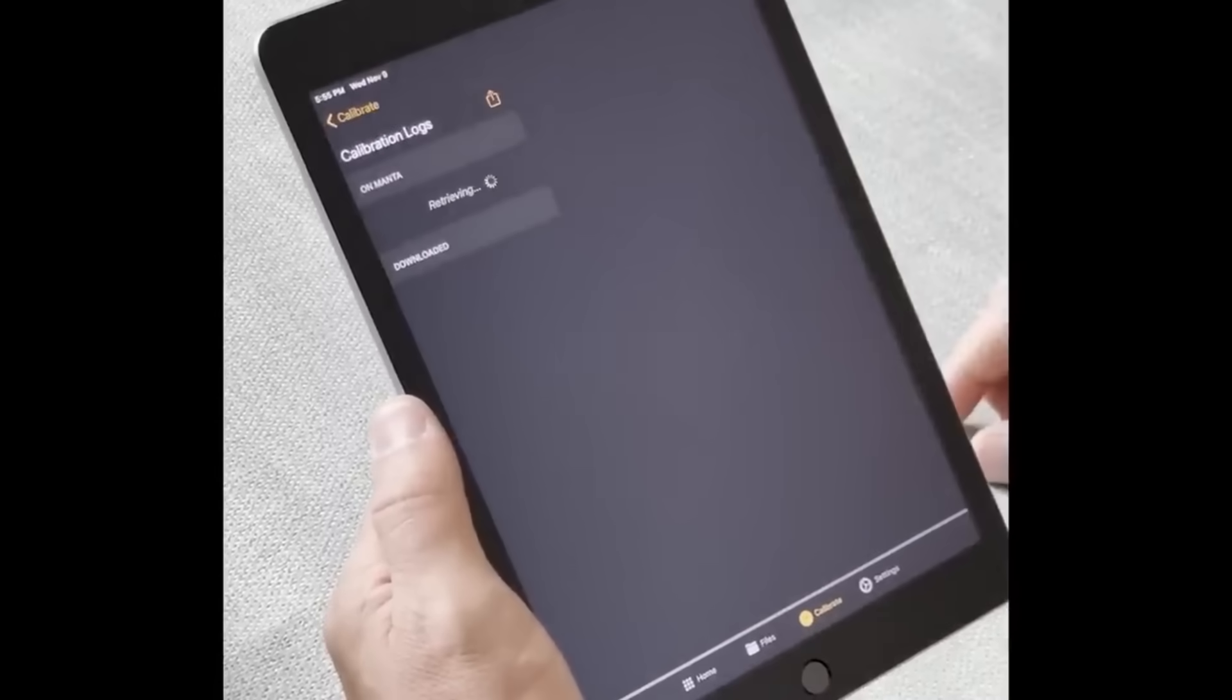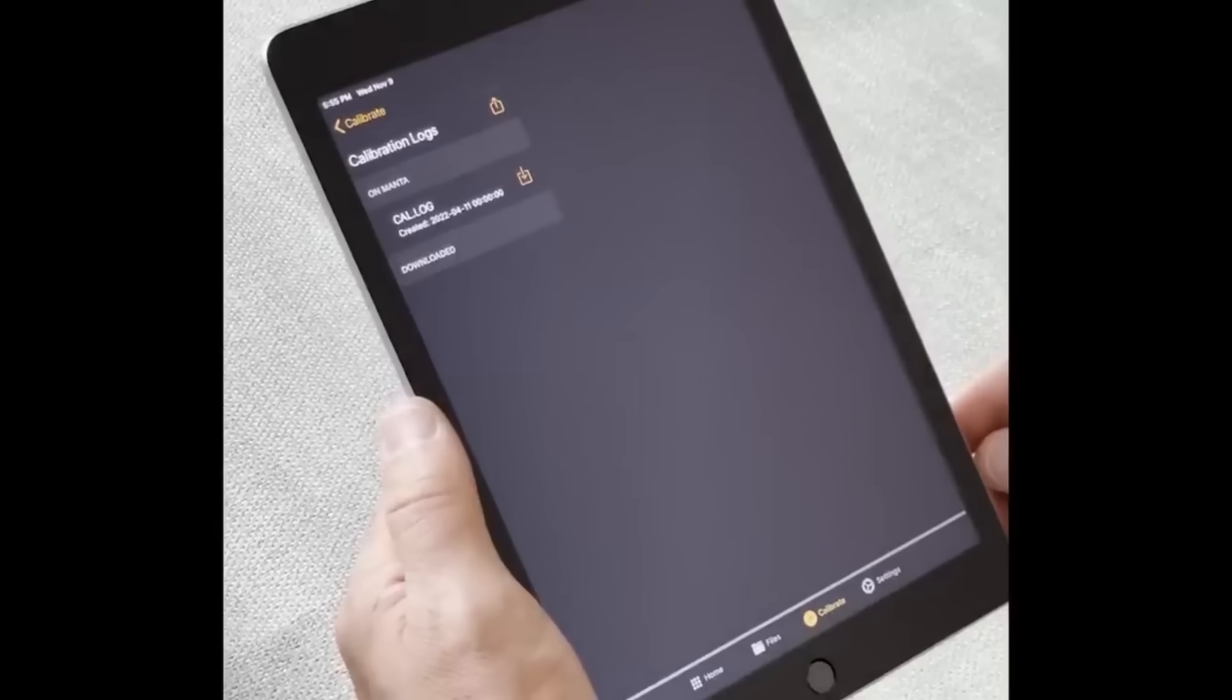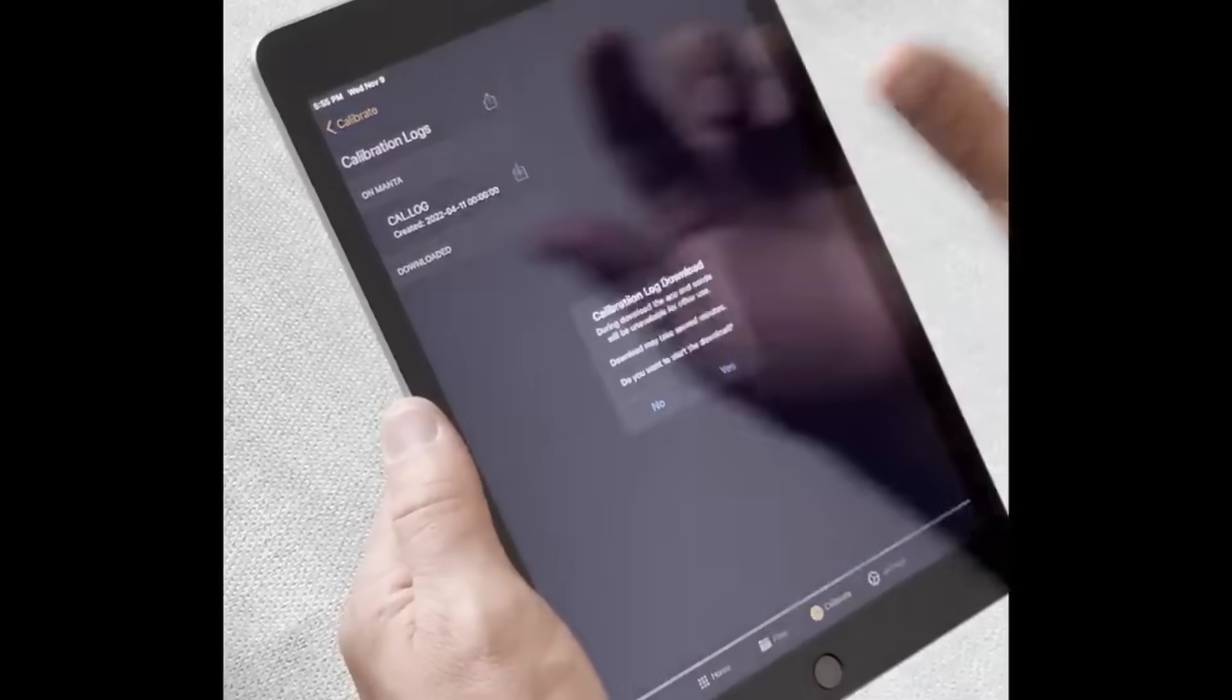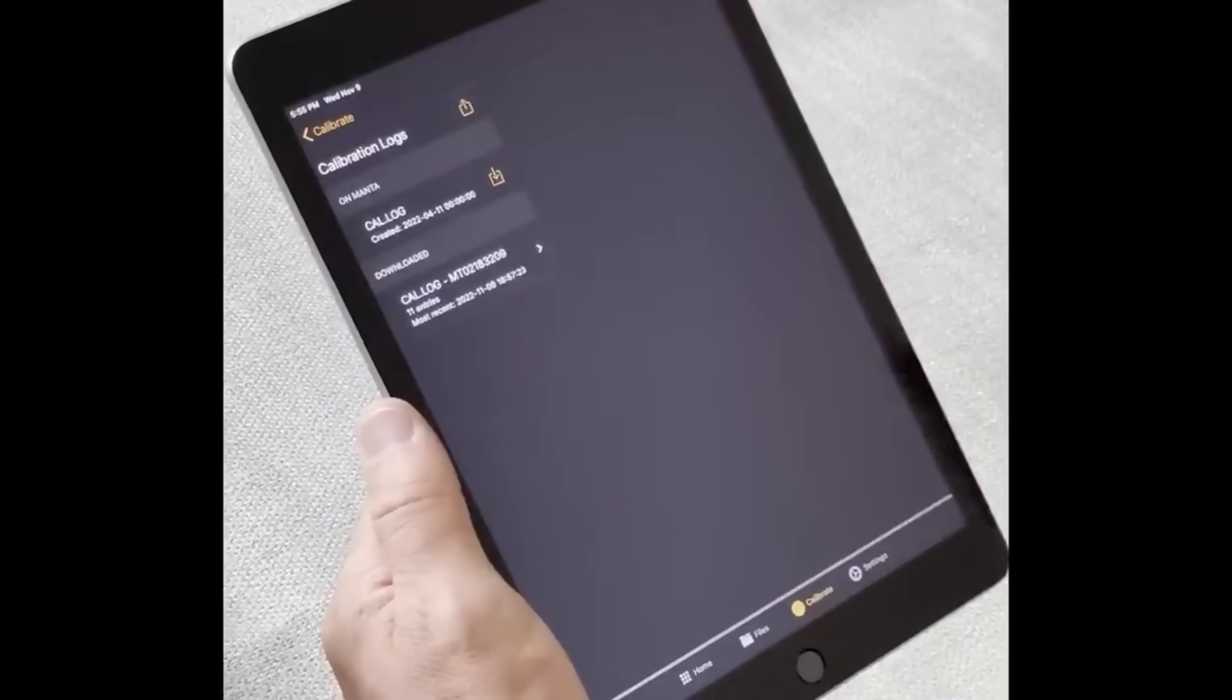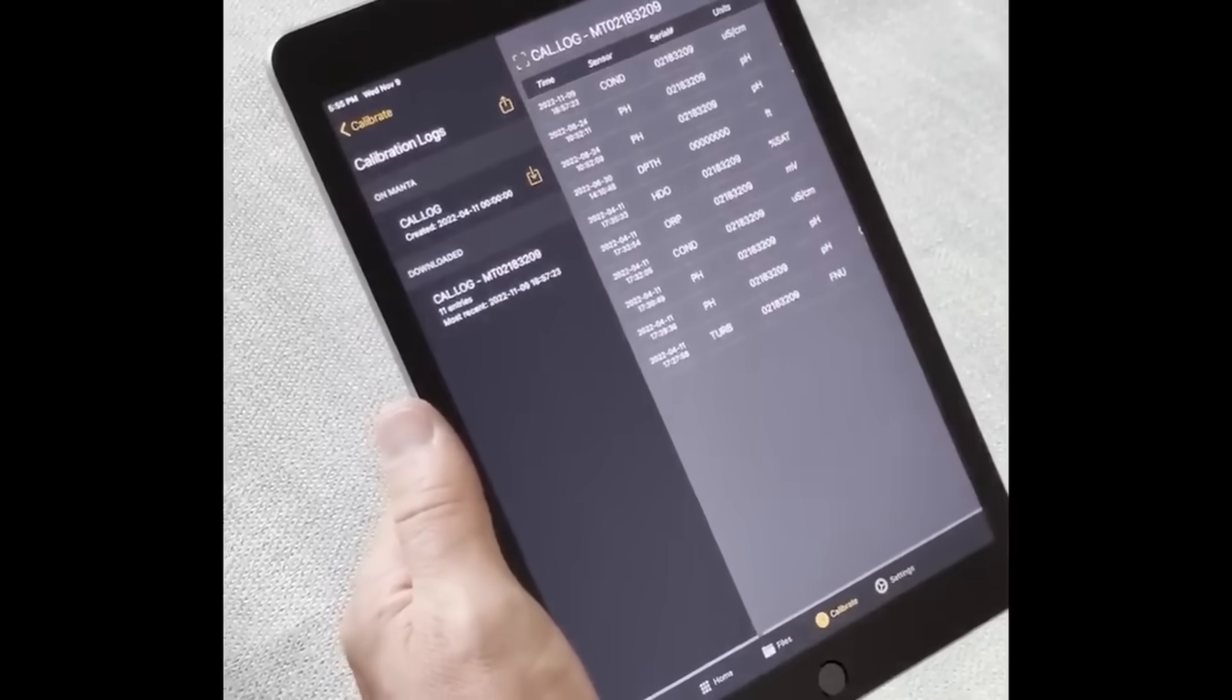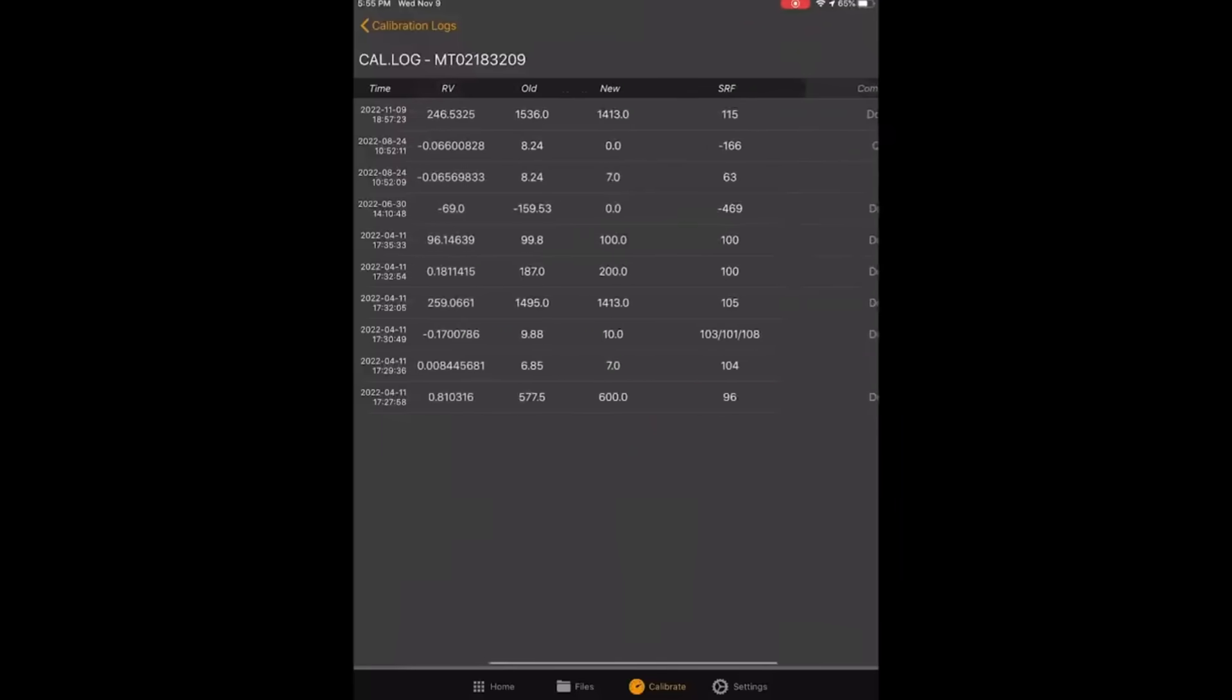Tap the cal log to review all of the previous calibrations done to any sensor. You can download the cal log. You can view it there. We're on a tablet, so you can expand the cal log to see the entire screen.